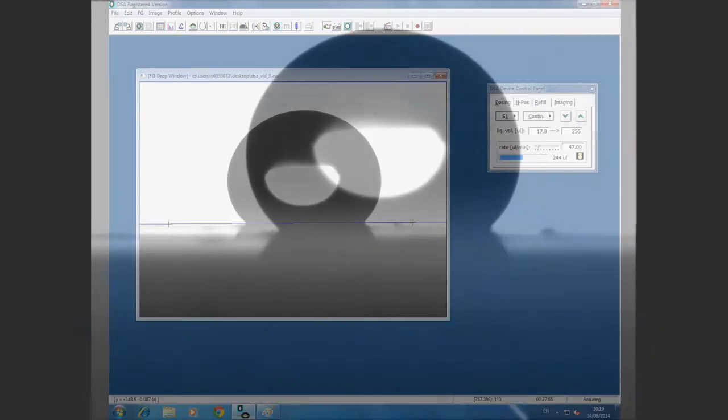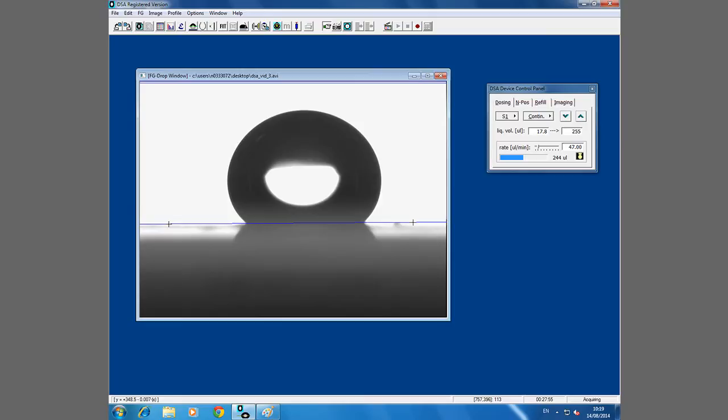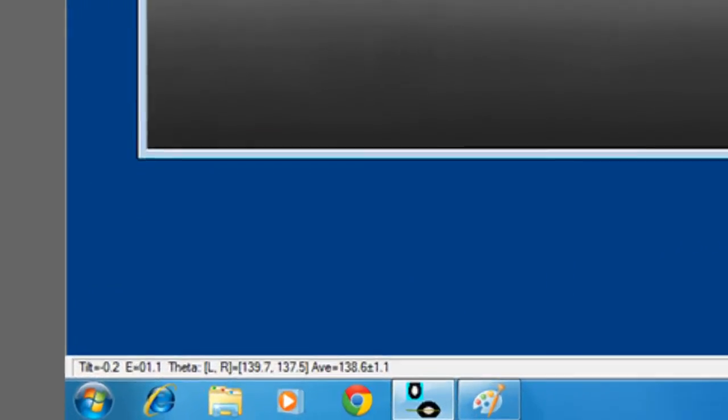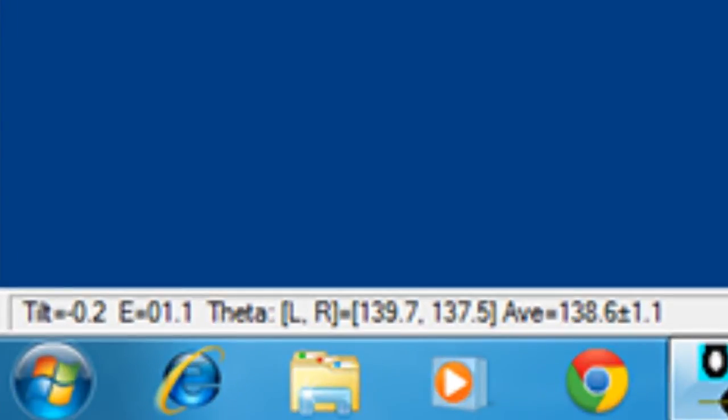When the image is properly adjusted, we can take a snapshot using the software. This can then automatically determine the contact angle and displays the left, right, and average angles.